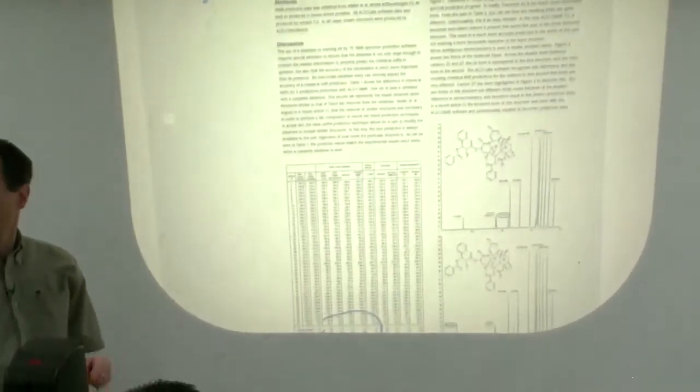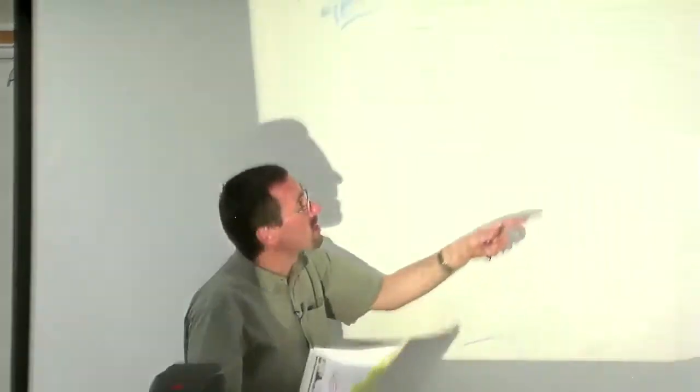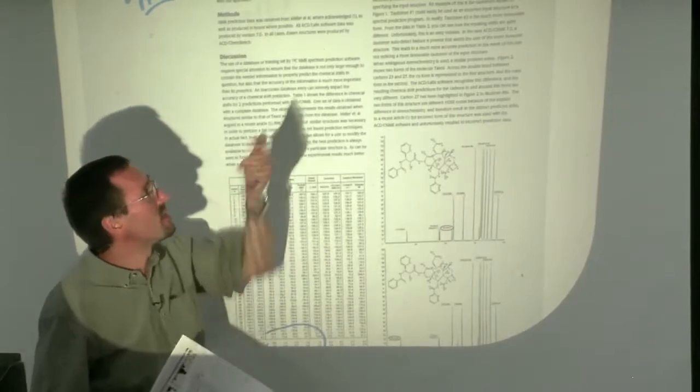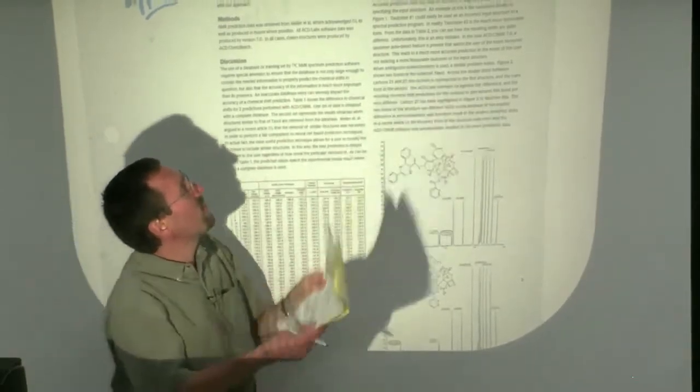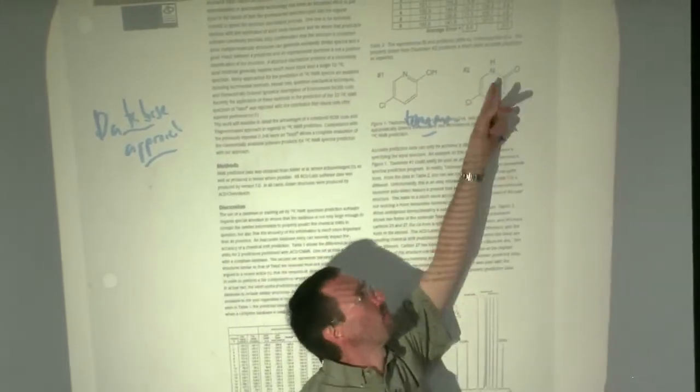And it's not so easy that you can take an IR spectrum, because by that point you end up with very strong stretches associated with the CN bonds of the pyridine tautomer. And so the IR spectrum is not clearly going to scream carbonyl at you. The C13 NMR, the difference between what you would expect here and what you would expect here for the carbonyl is small enough you can't just look and say, obviously I have the pyridone, or obviously I have the other compound.